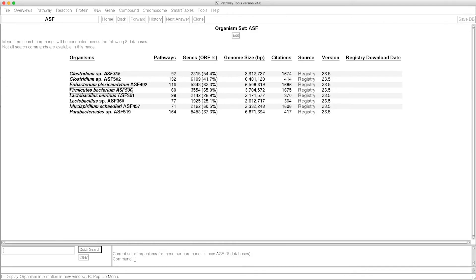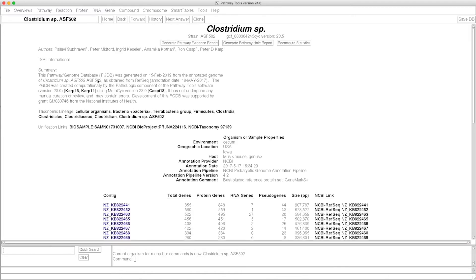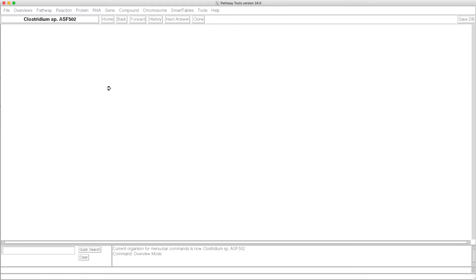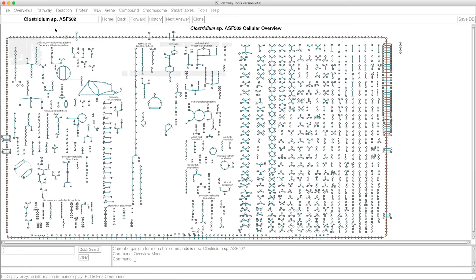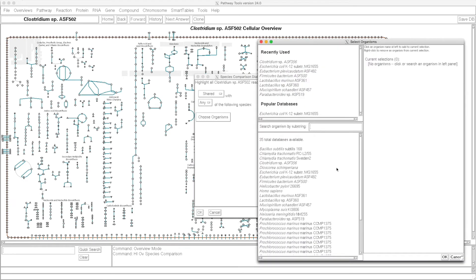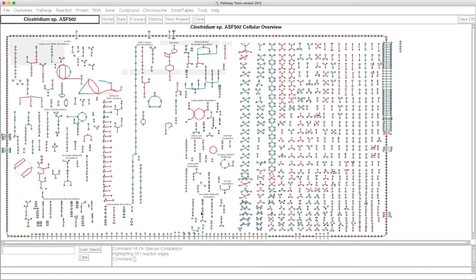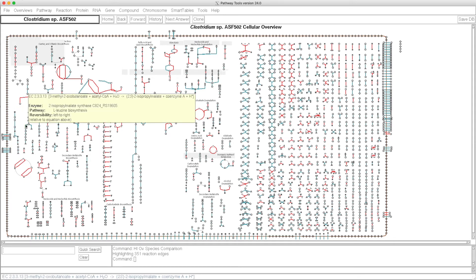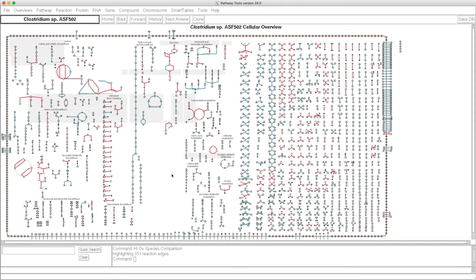Let's do another comparison now between organisms in this community. Let's click on one of the organisms to select that as our current organism and show its metabolic network. Let's now do a species comparison of that metabolic network with this Lactobacillus species. Everything highlighted in red is common between the two organisms. The pathways still in blue are present only in this Clostridium and not in the second organism that I selected.